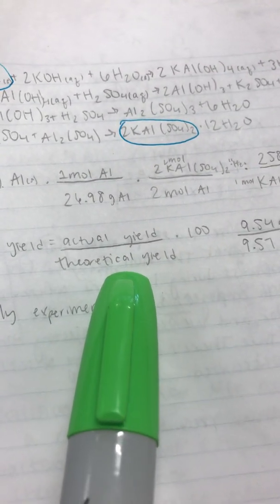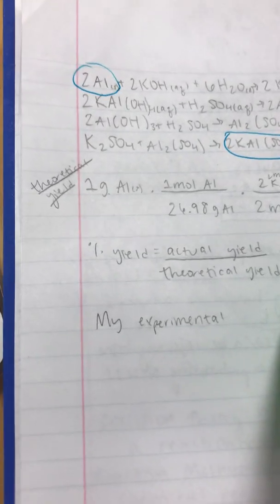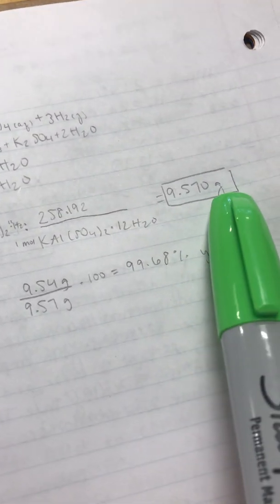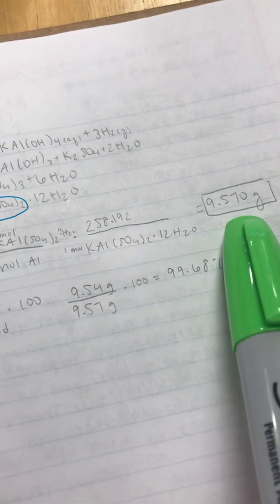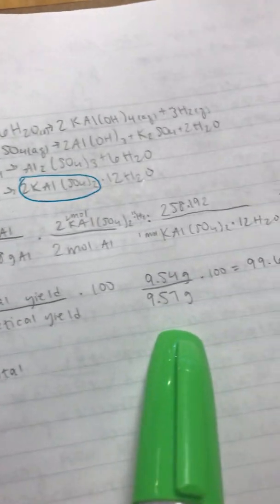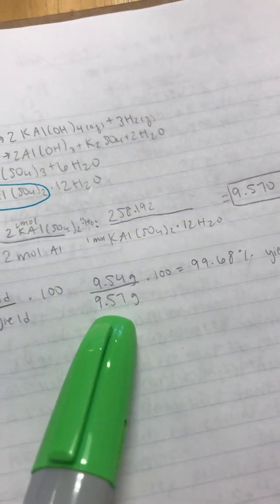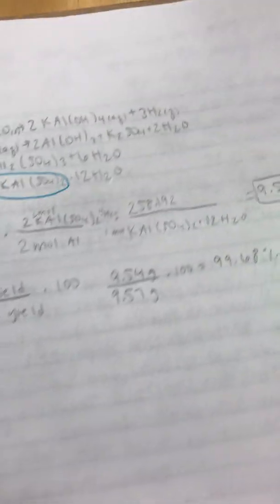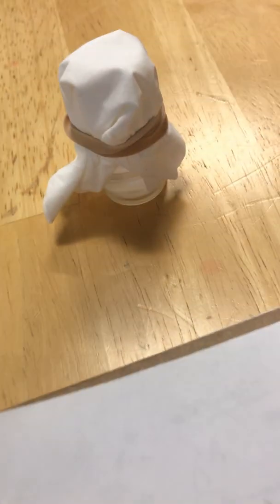And so percent yield is the actual yield over the theoretical yield times 100. And this just tells you how effective your experiment was in producing as much product as it theoretically could if everything were to go correctly. So theoretically we could have produced a max of 9.57 grams of alum due to our initial starting point. And we ended up getting 9.54 grams, which is actually really close. When I did this calculation, I found that we had a 99.68% yield, which is really good. We're happy about that.